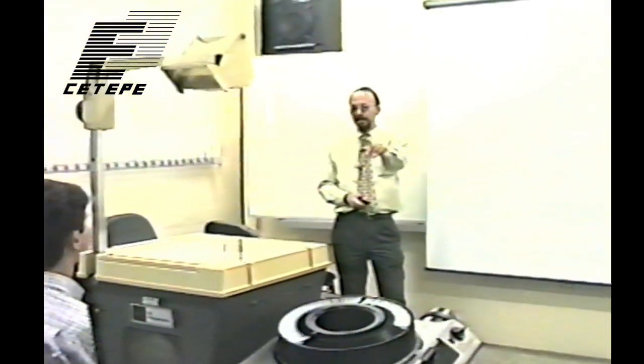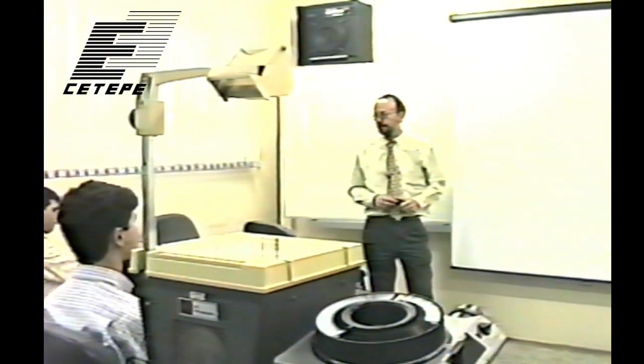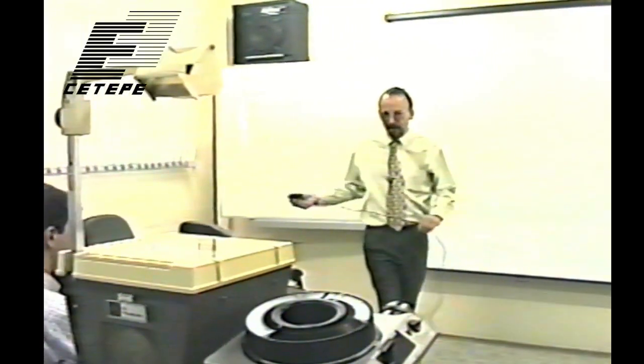Okay, so that's that. And now I want to basically shift gears and go back to where we were at the end of the first day to get into the computed tomography aspects. So I have to momentarily switch to the overheads.